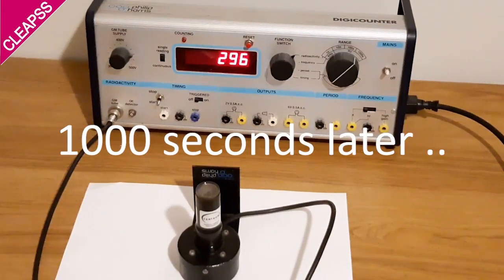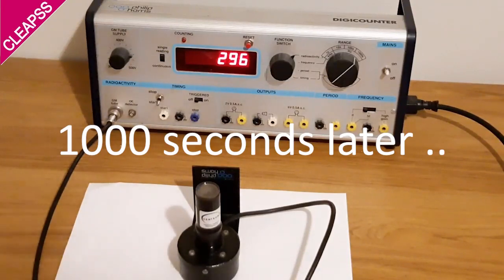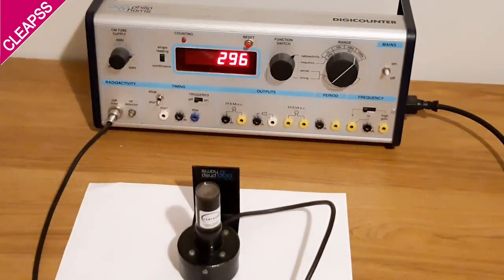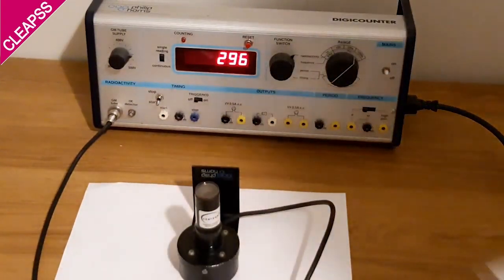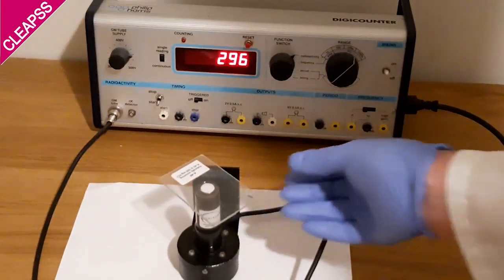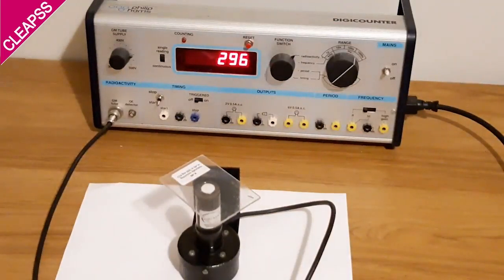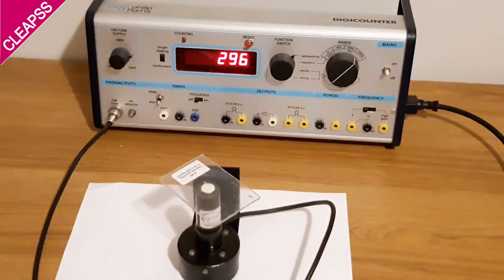So the background count is 296 and I make a record of that. I now put on the test source. Make sure that the active part of the source is right in the centre of the GM tube and I start again to count for 1000 seconds.